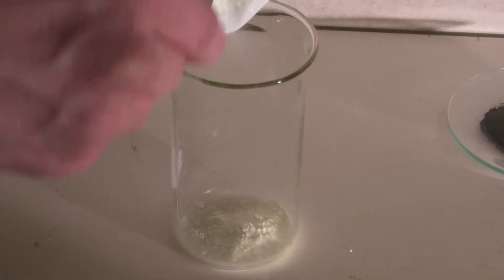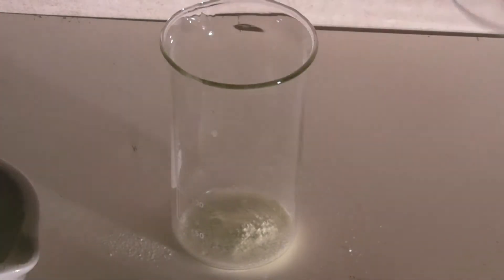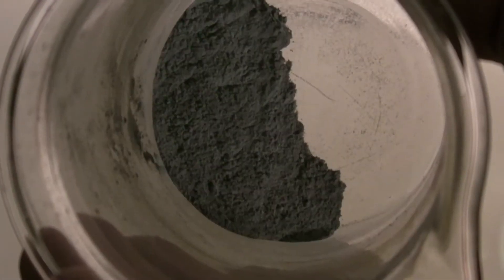The zinc powder must not be added at this step because this could cause the mixture to react. Then the sulfur and the zinc powder are added to a beaker and swirled until a homogeneous mixture is obtained. In the finished mixture, the sulfur is almost invisible.